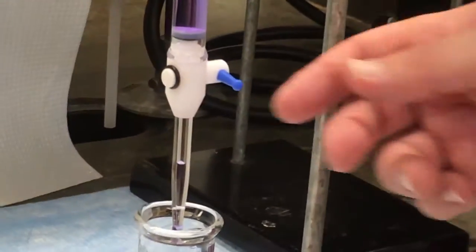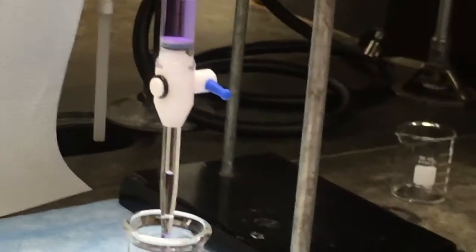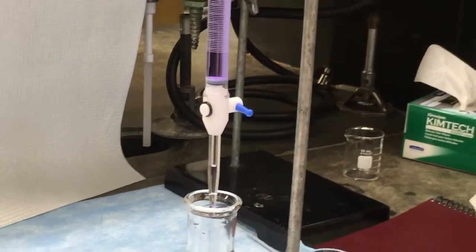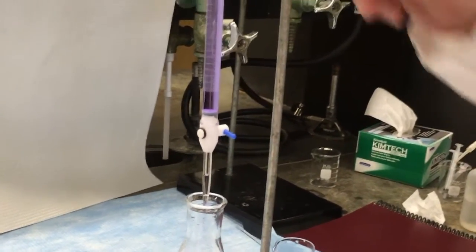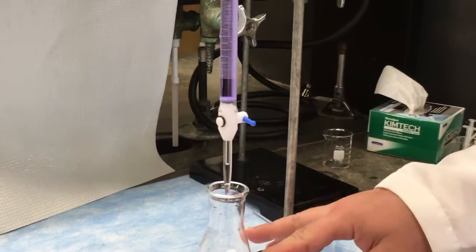Now, if I want to deliver some volume of solution, my next step is to open the stopcock and let it drain through. Now, if I'm trying, let's say we're trying to deliver 1 milliliter, I try and get down to 10.25 mils. More often, you're doing a titration where you're delivering some volume of solution and watching for a color change.